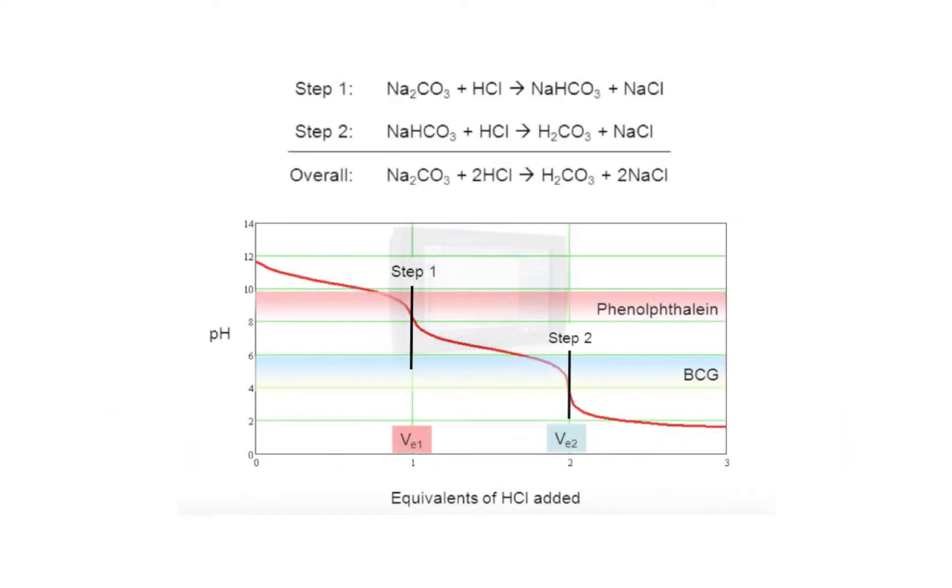Unknown B is an impure sample of sodium carbonate. You will be calculating the percent sodium carbonate in your assigned sample.